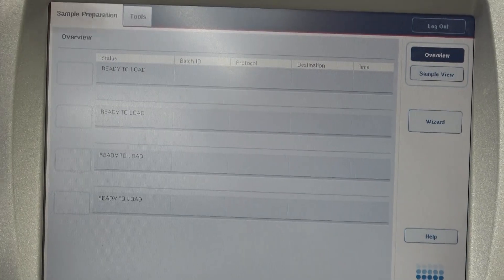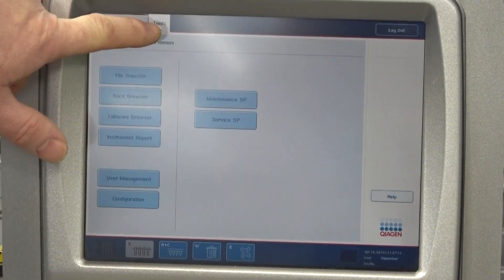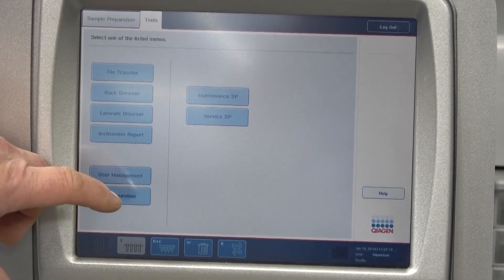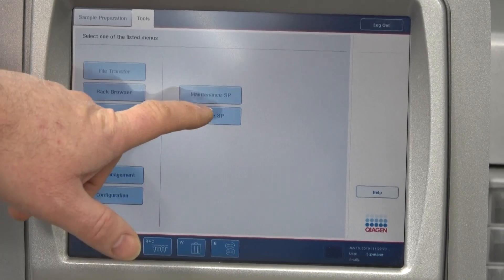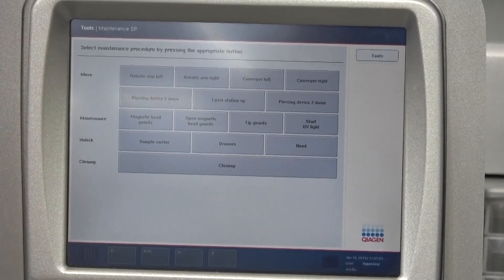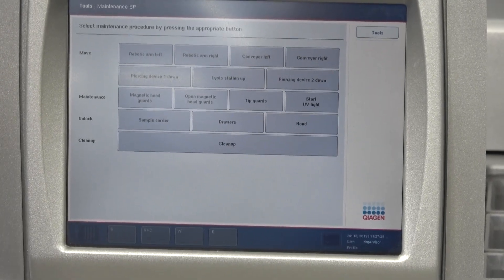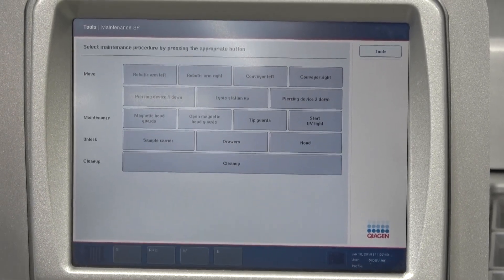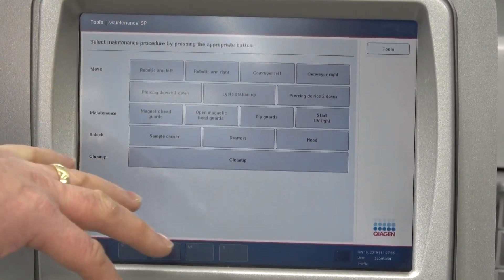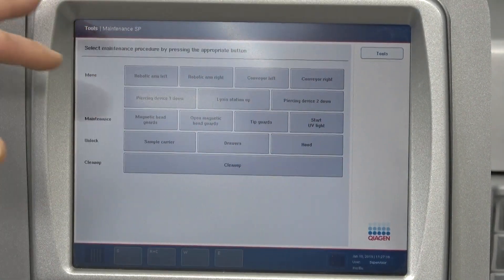Right now I'm going over to the tools folder, and I just want to do a couple things. First, we're going to look at the maintenance area, where we can just run the machine a little bit. And then also I want to look at the hours on the machine, because it actually has fairly low hours. But right here it's just a screen where you can access all the components and run them.